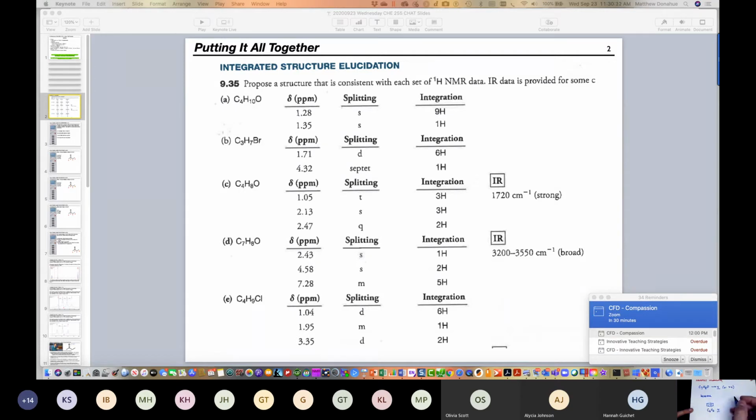So let's sort of use that logic we started with last chat session. C7H8O. We already know, we're not even looking at the NMR data just yet, this has 4 degrees of unsaturation. We're making the assumption there's benzene, C6H6. That gets us C1H2O. So that has 4 degrees of unsaturation. This has 4. So the remaining stuff has none.